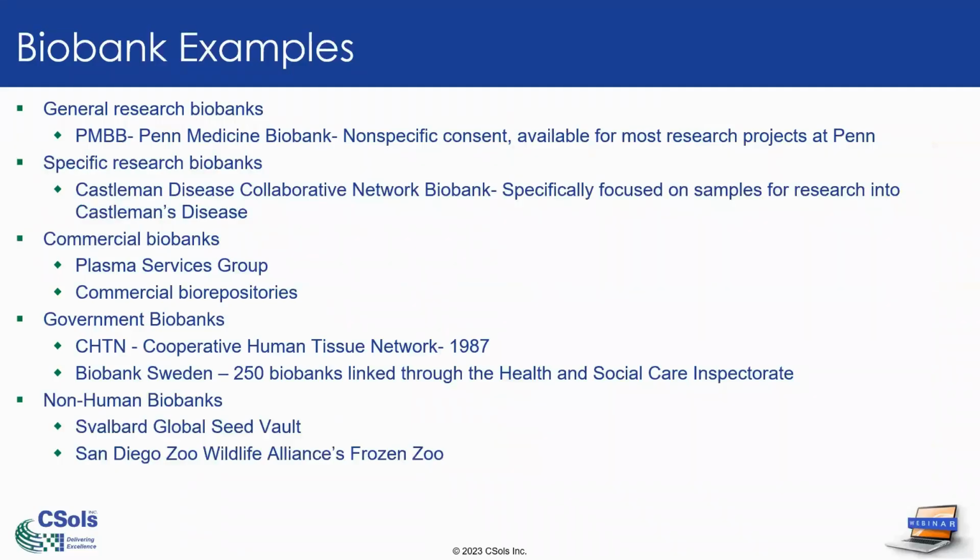So I wanted to throw in some examples of biobanks, some of which I've worked with and some of which I only dream of working with. In the academic research space, there are things like the general research biobanks, where a large institution may have a non-specific consent for participants to donate samples to research across the whole institution. You also may see more specific research biobanks, some for individual large-scale longitudinal studies where they're collecting enough samples to really start considering their repository a biobank. Others for things like rare diseases.